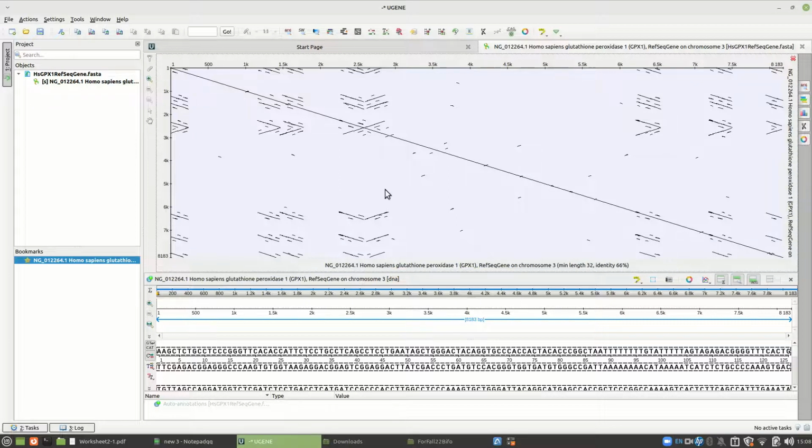Now I need to find my promoter up here, and how am I going to find it? Well, the first thing I'm going to look for, the only thing up here that gives me the idea that there's something interesting going on, is this little piece right here. So I want to click on that. Sometimes it's hard to click on that. That shows the whole line. I want just that piece.